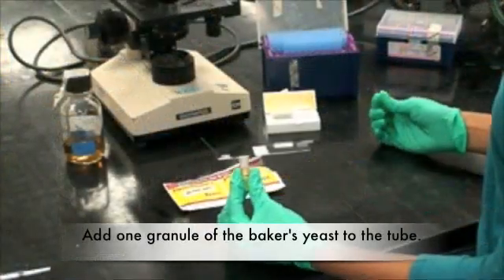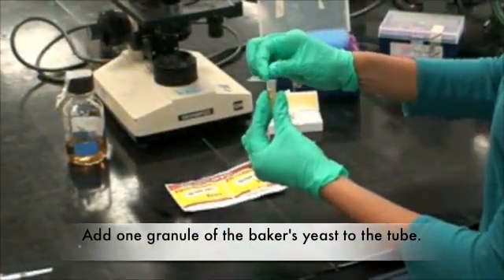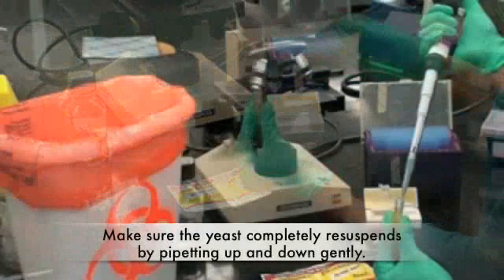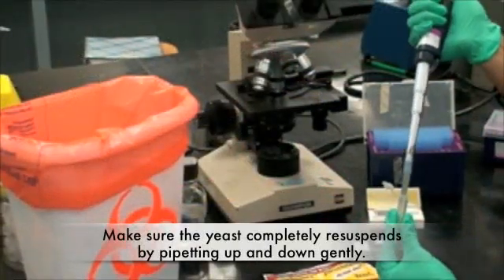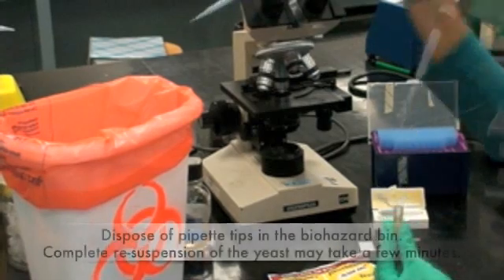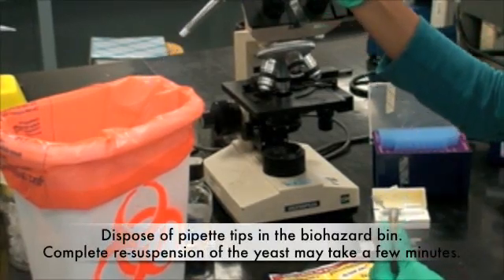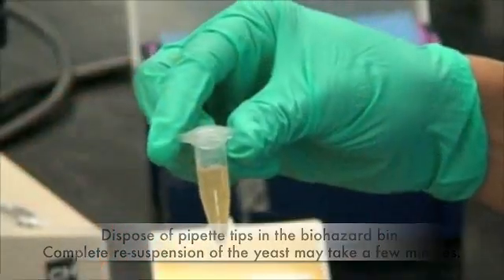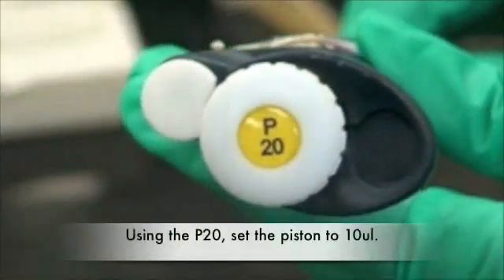Add one granule of the baker's yeast to the tube. Make sure the yeast completely resuspends by pipetting up and down gently. Dispose of pipette tips in the biohazard bin. Complete resuspension of the yeast may take a few minutes.